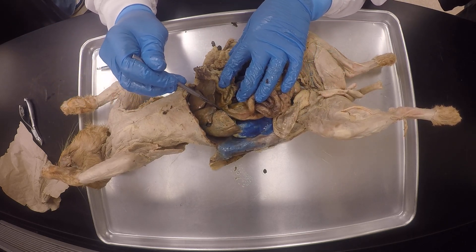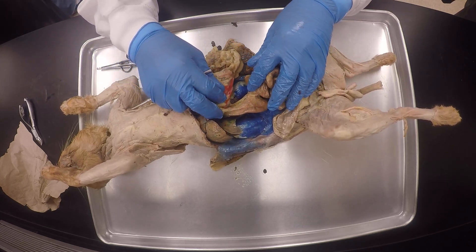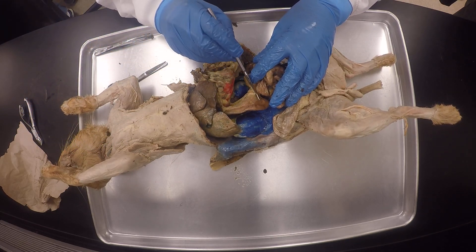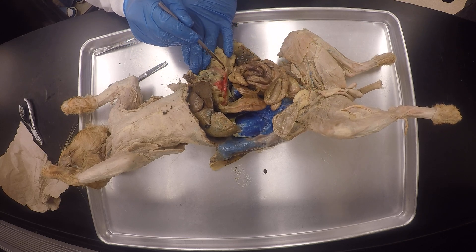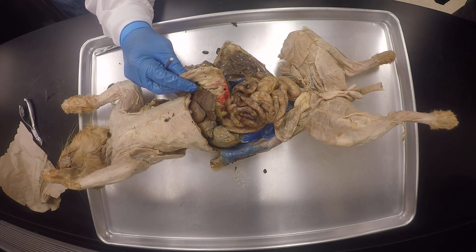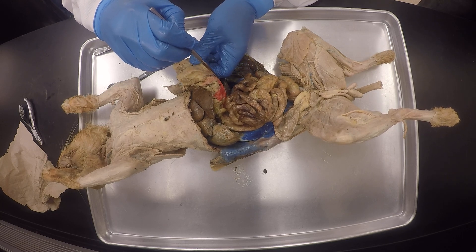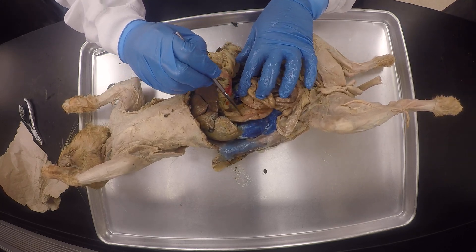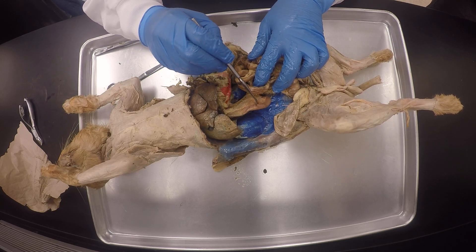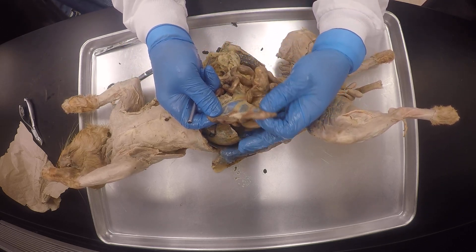There's the pyloric sphincter, and then this is the duodenum. The duodenum cradles the head of the pancreas — look here, all of this is pancreas running alongside the duodenum all the way over, and then there's the spleen over there. The pancreas runs alongside the duodenum. Then anywhere in the middle is the jejunum, and there's the mesentery — do you see that?